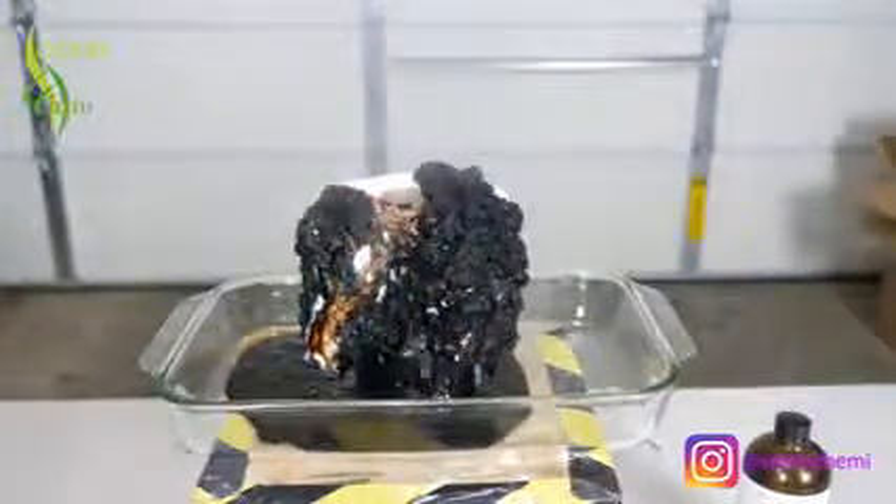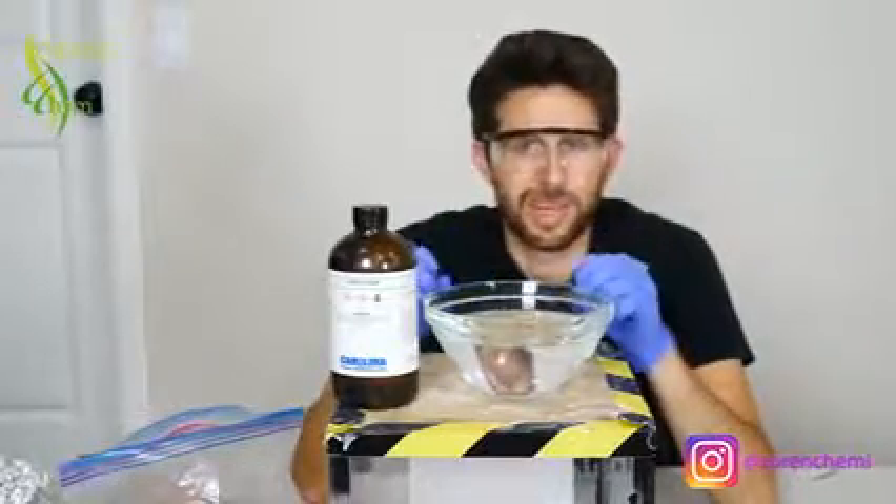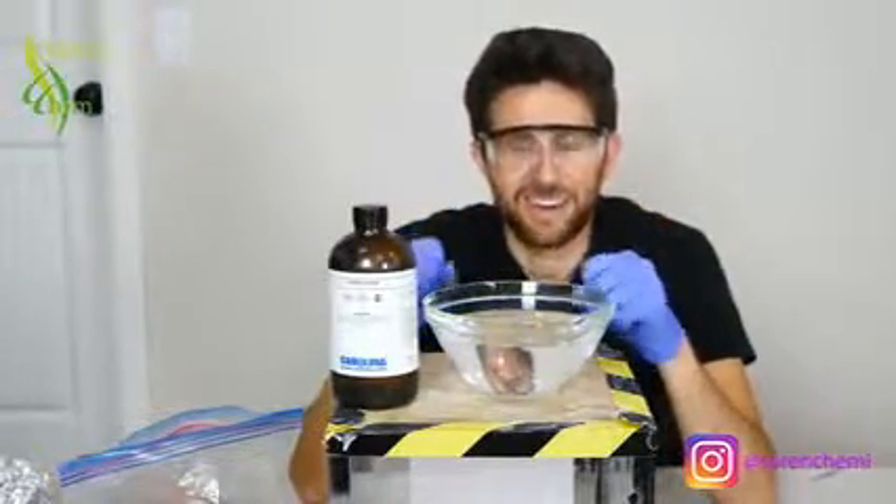If you mix it with hydrogen peroxide, then you get an even crazier solution that can now also dissolve pure carbon, called piranha solution. Here's when I dissolved a hot dog with piranha solution.